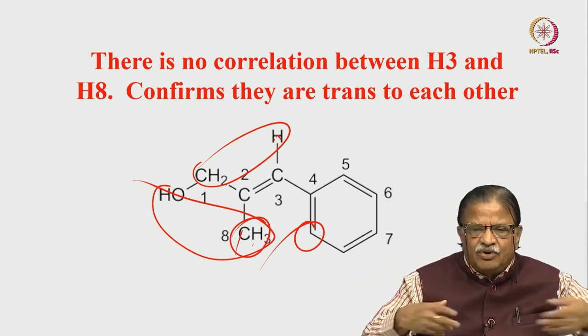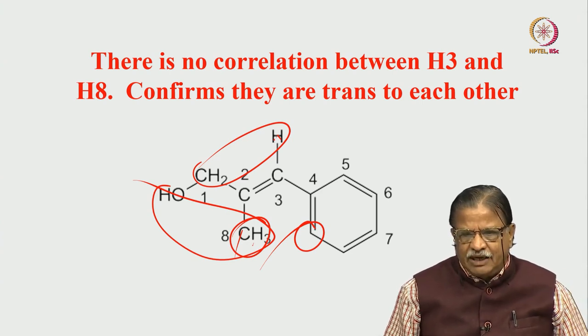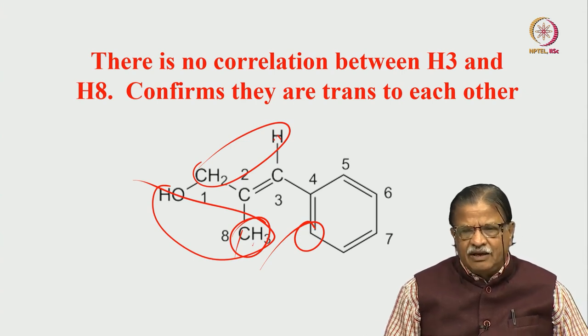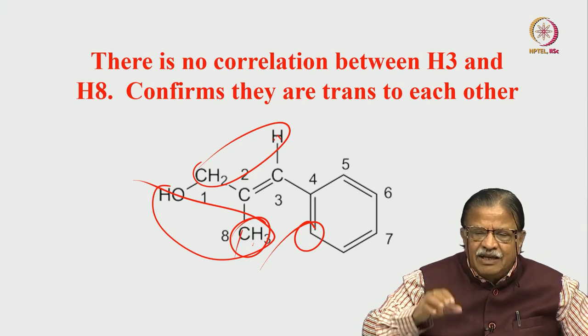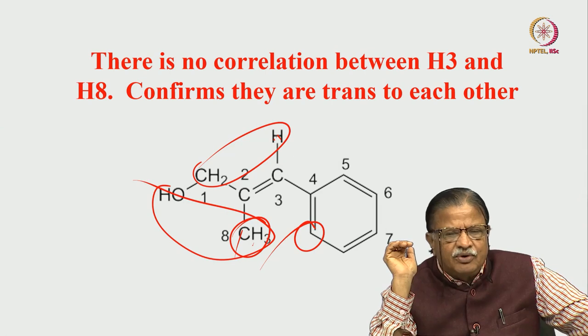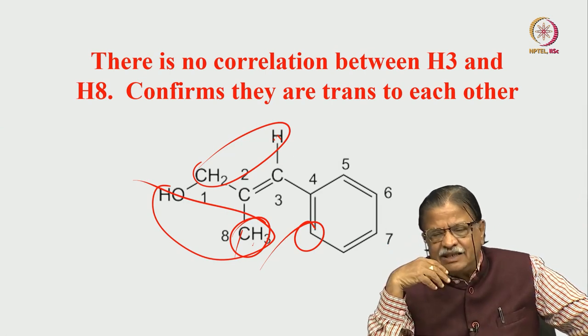If you are a beginner, you should go through all the spectra so that you know how to go systematically. Or if you are already working with NMR and have a little bit of experience, a couple of weeks or months, you don't need everything. Just a 1D spectrum or COSY will give some information. Straight away you can go to NOESY. Based on the correlation information, we could get the structure of the molecule.